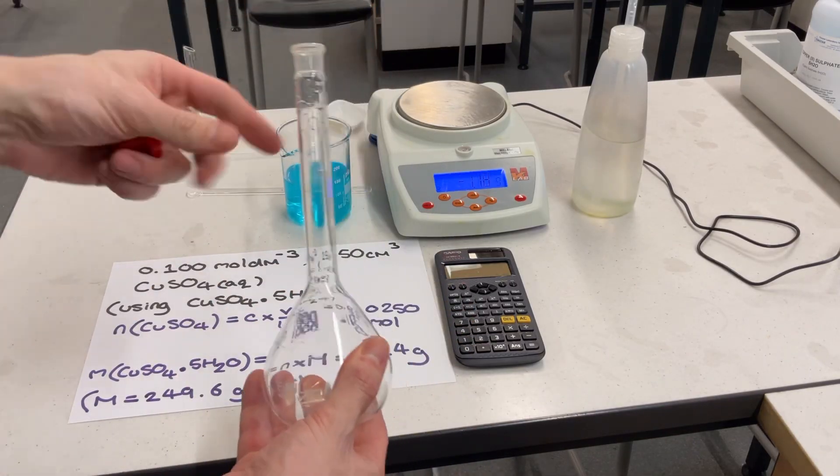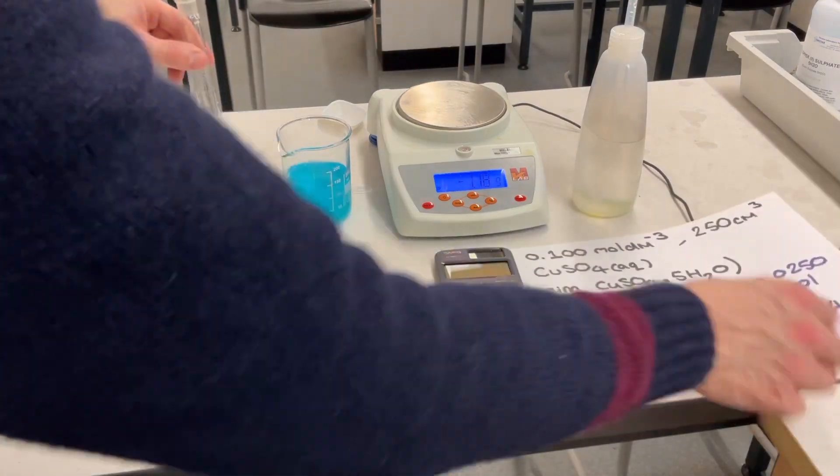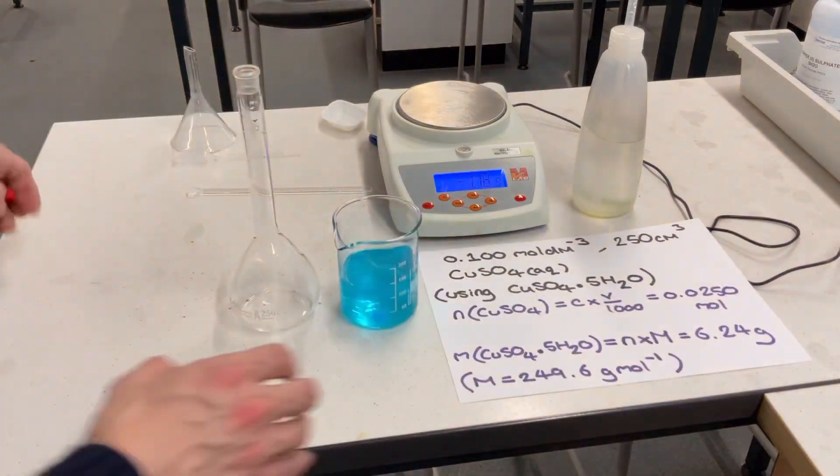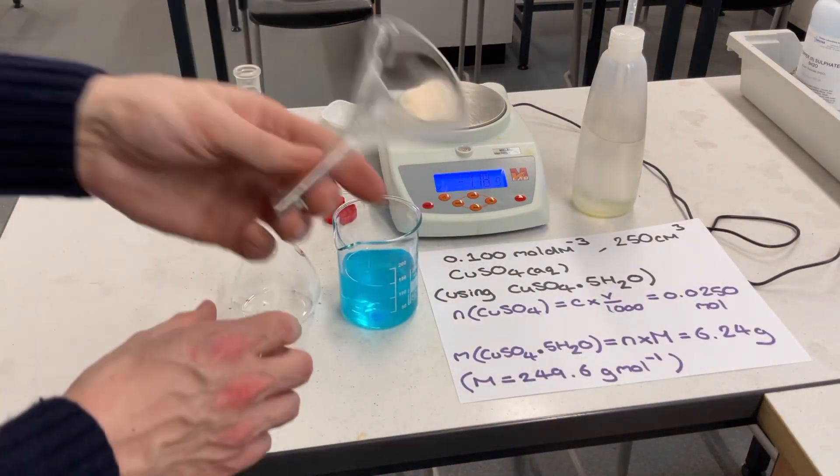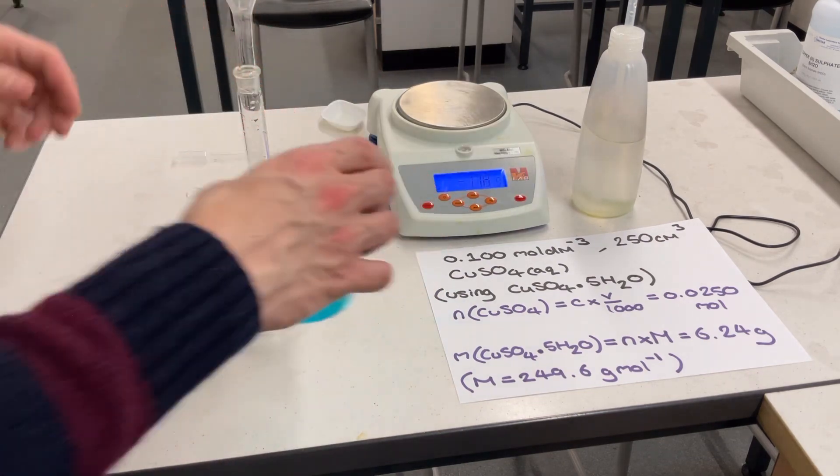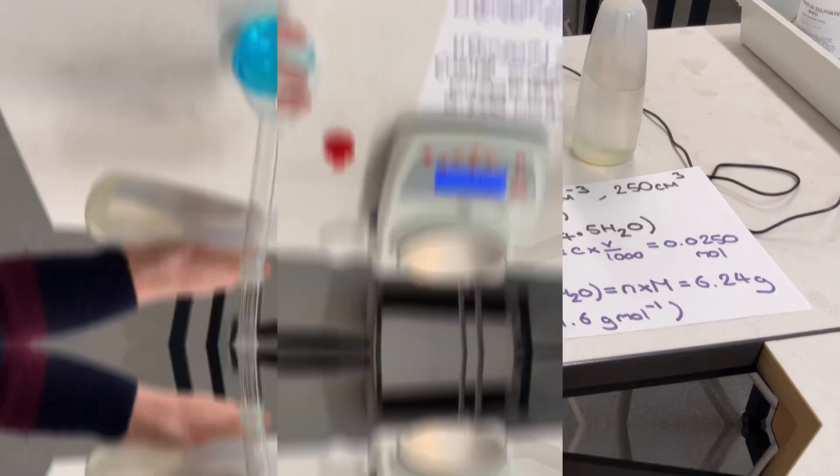Step 3: Since I'm preparing a 250 centimetre cubed standard solution, I now use a funnel to transfer my solution into a 250 centimetre cubed volumetric flask.